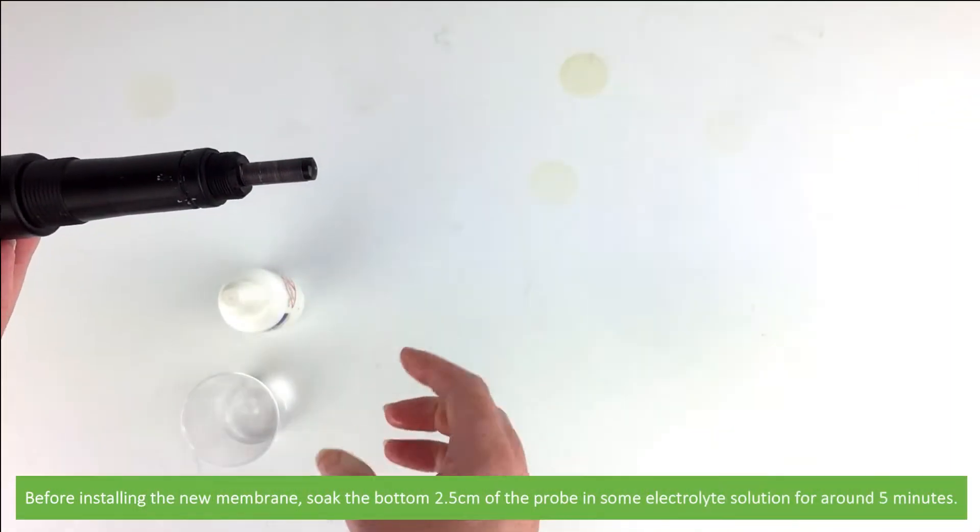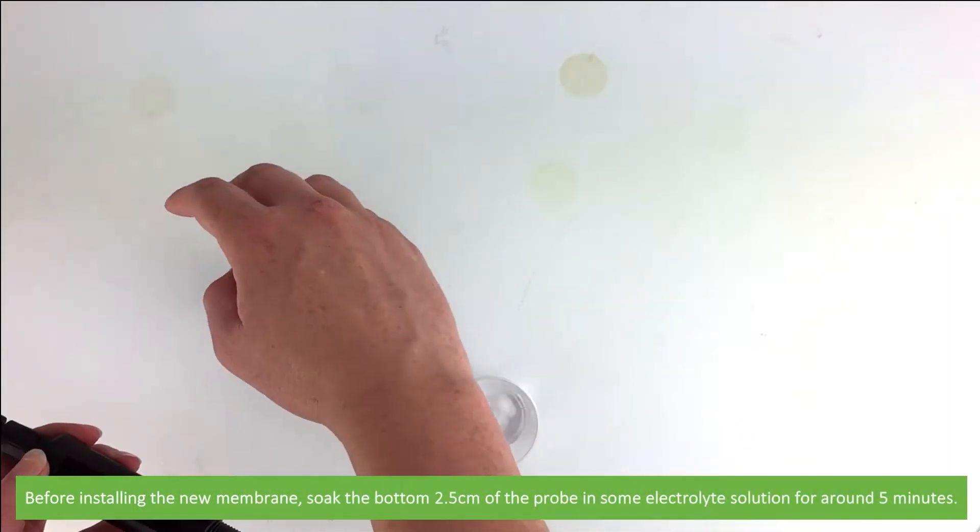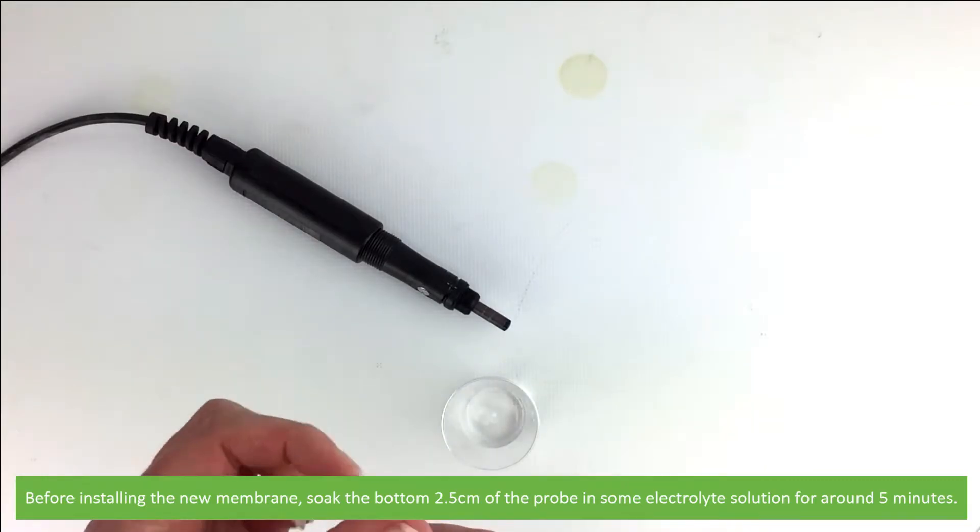Before installing the new membrane, soak the bottom 2.5 centimeters of the probe in some electrolyte solution for about 5 minutes.